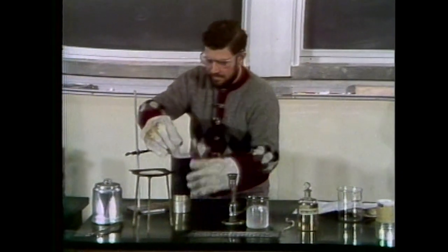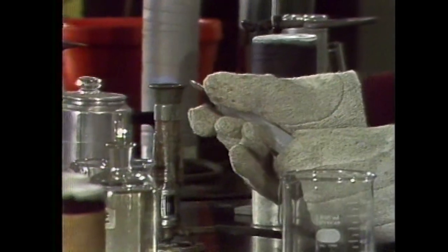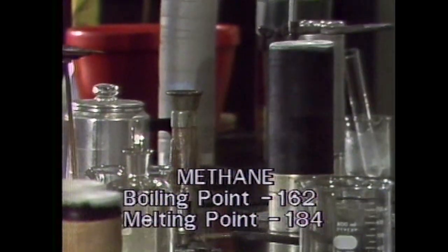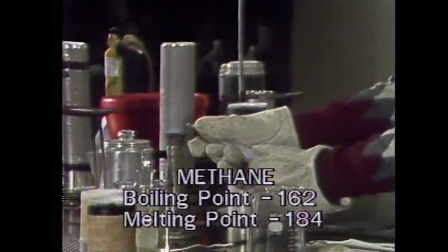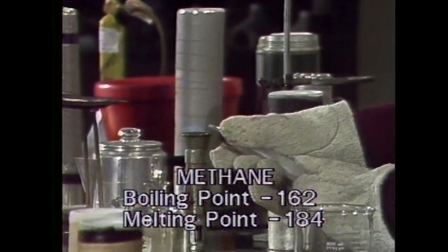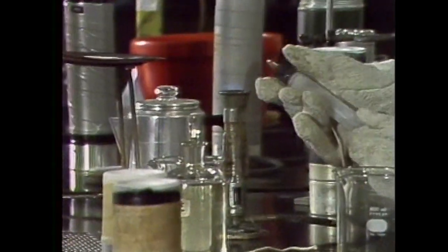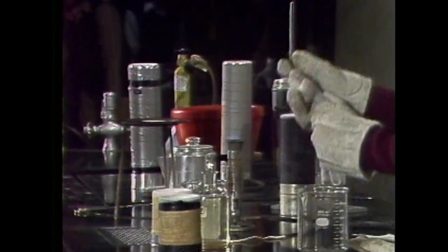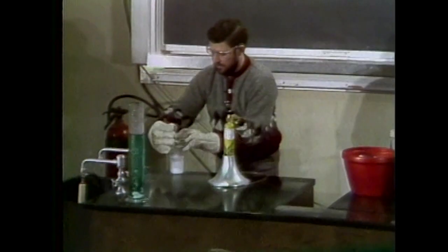And you see I have this liquid methane. I'm going to warm it up now by just holding it up here. And as it vaporizes, it's going to... Can you see the flame? You see the flame? You can see the jet. Okay, can you see the jet? That's the liquid methane vaporizing coming out through this nozzle. You can see it's boiling away right there and there. What's happening is that it's coming out at such a fast rate that it's putting out the flame. So we'll just let this go for now.